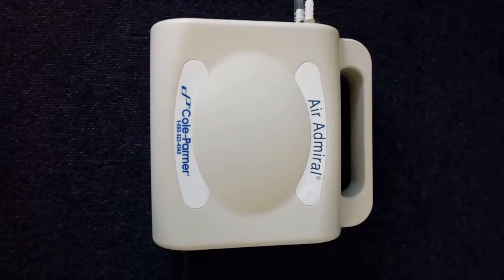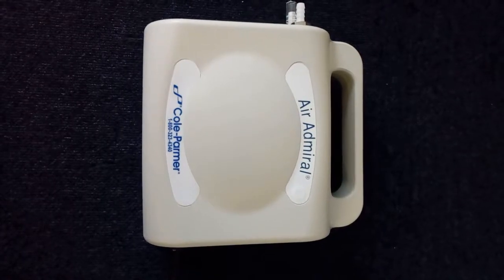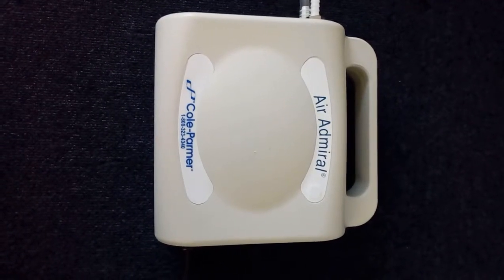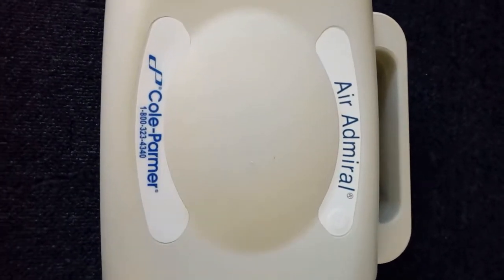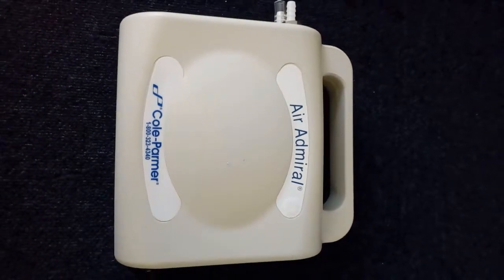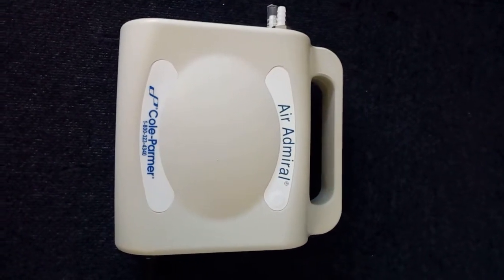This is Lisa Gregory from Richmond Scientific conducting a quick video on the Air Admiral by Cole-Parmer. This little piece of equipment is in excellent condition.